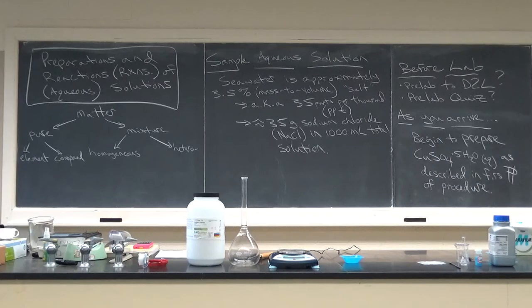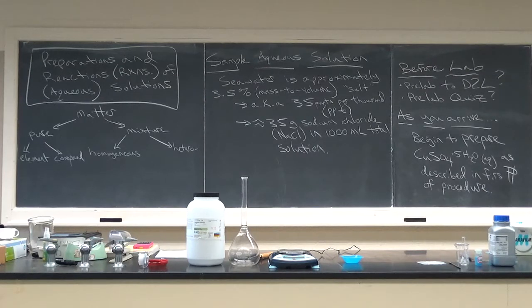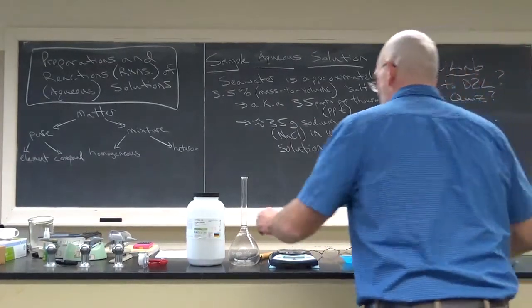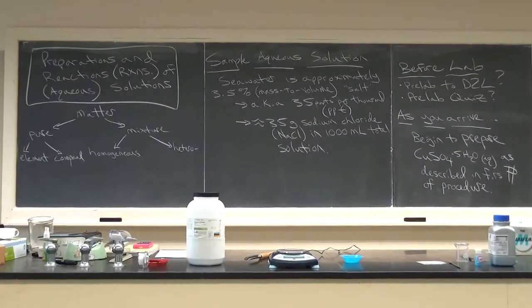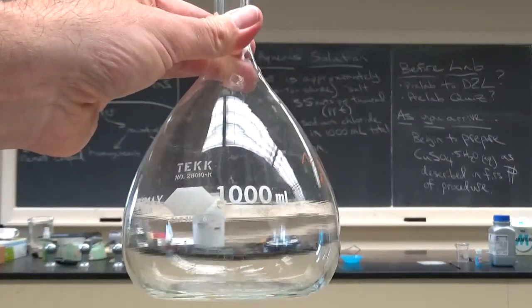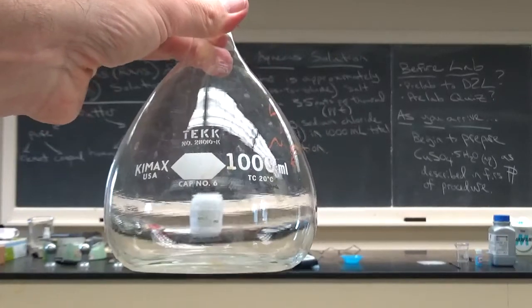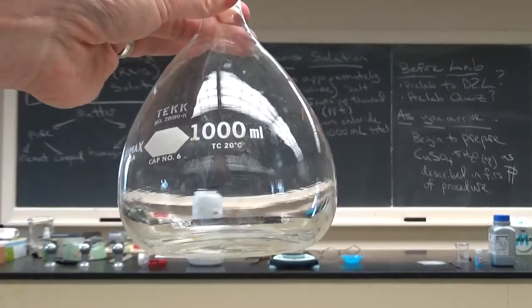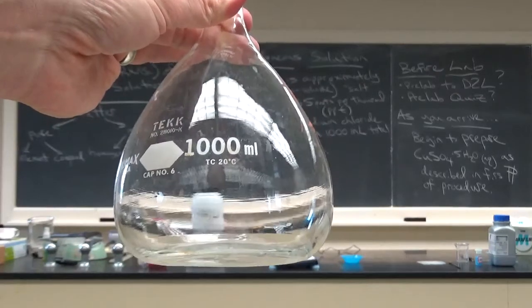Before I come out, I want to show you two key pieces of equipment—incredibly precise ways of measuring volume. This is a 1000-milliliter volumetric flask. You can see the TC marking on there, which means 'to contain at 20 degrees Celsius.'